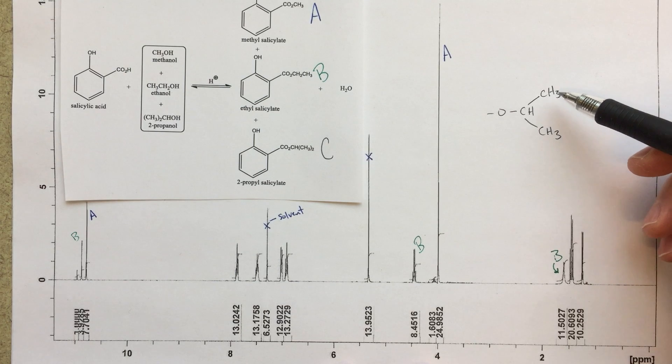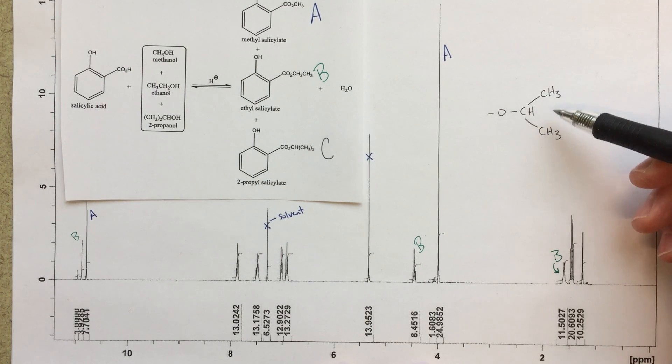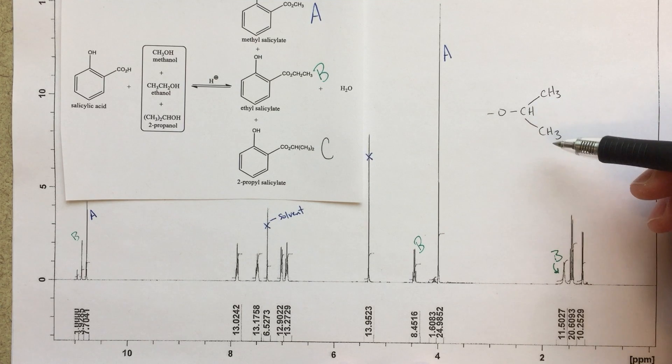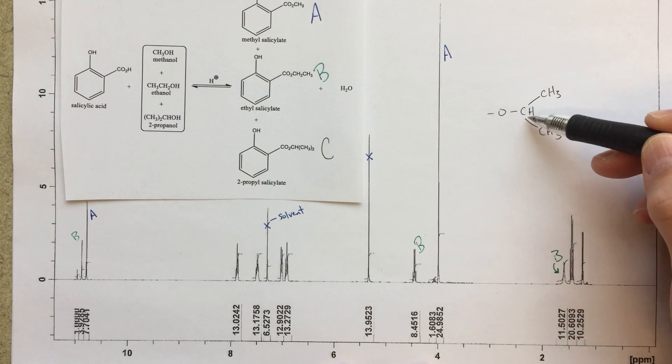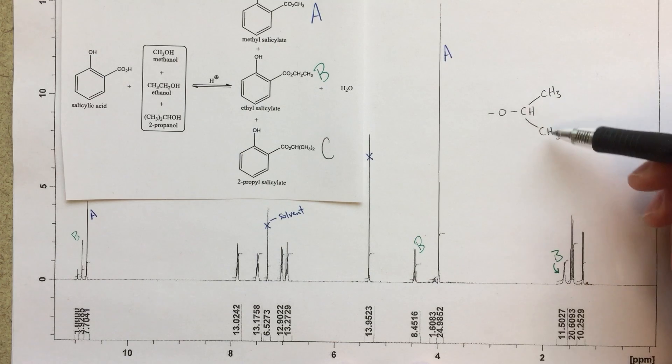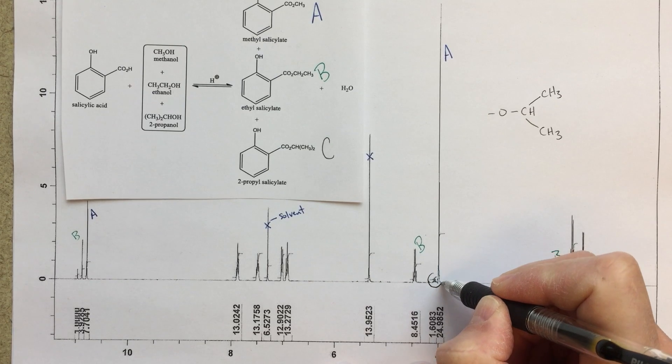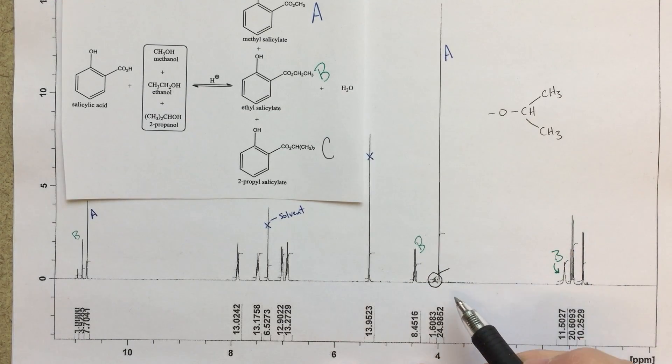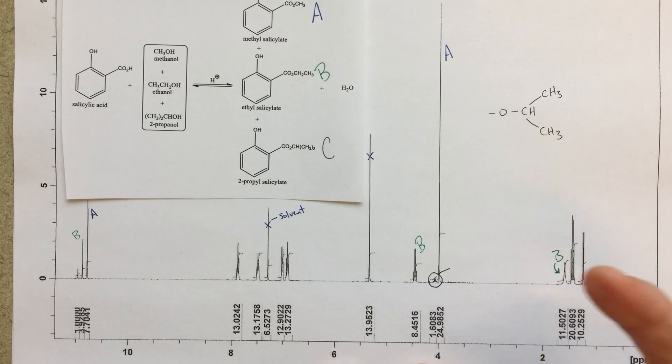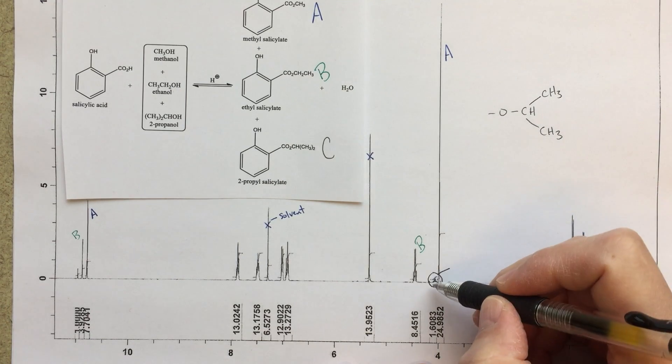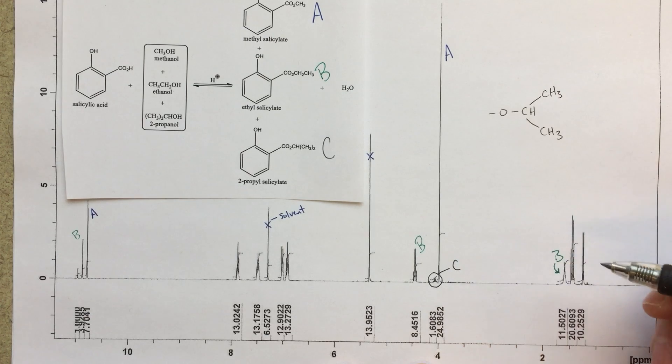So what I'm looking for would be a six-high doublet. So these methyl groups, they're going to be chemically equivalent, and so they should be a doublet. They should be six high, and then they should also be a doublet because of the CH group here. And then we're going to look for a one-high septet that's being split into seven different peaks by these methyl groups. So right here, it's sort of hard to see, but if we sort of zoom in, we can see this little, little peak here that should integrate to relatively one, right?